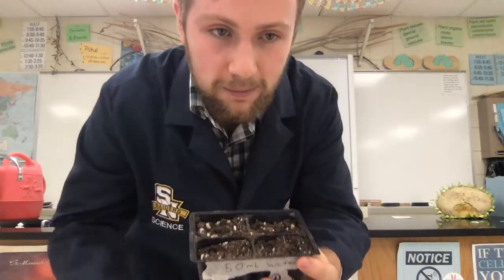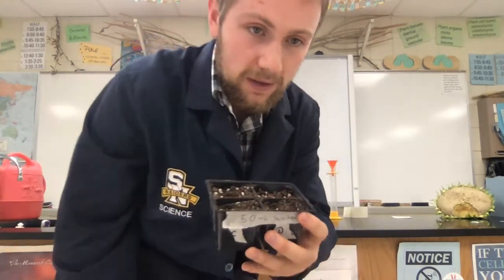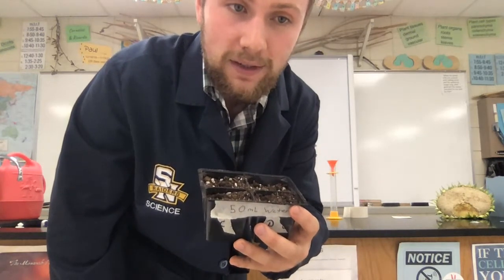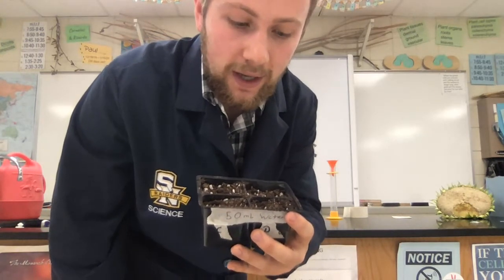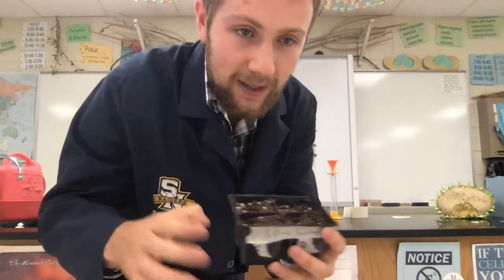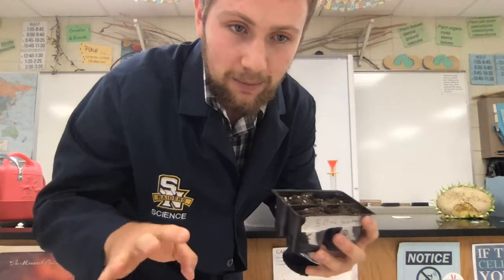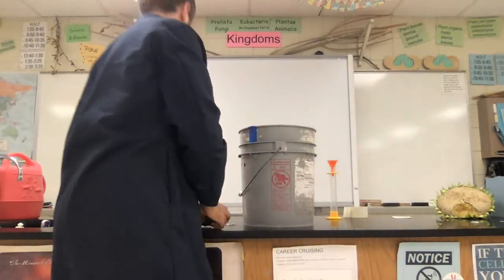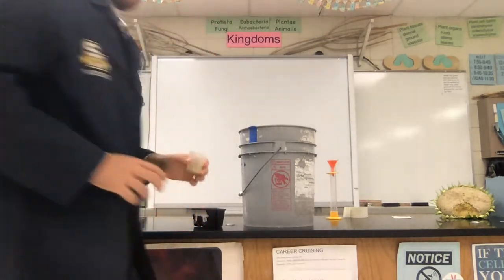Now I will grab some seeds, and these are old seeds, so we're going to see if they germinate and grow, but it's a good experiment in and of itself. So let's try it. We're going to have a total of 8 seeds, 1, 2, 3, 4, 5, 6, 7, 8. Exact same seeds from the same type of long keeper tomato packets. All right, so let's grab our seeds. I'll show you what the seeds look like.